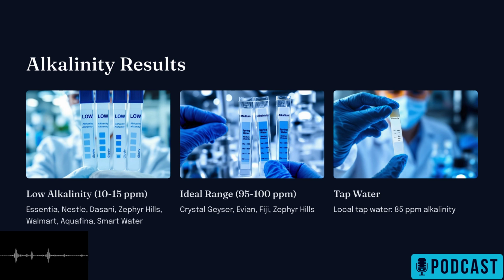Now, the test didn't stop there, did it? It cast a pretty wide net, looking for a bunch of other potential contaminants. Yeah, they tested for quite a list. Things like hydrogen sulfide, iron, copper, lead, manganese, total chlorine, free chlorine, nitrate, zinc, and fluoride. Okay, quite comprehensive. And what was the verdict there? Well, the reassuring news really is that for all those things, the levels were found to be negligible across all 10 bottled waters and the tap water sample they tested.